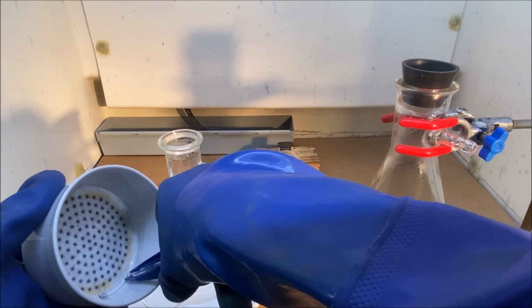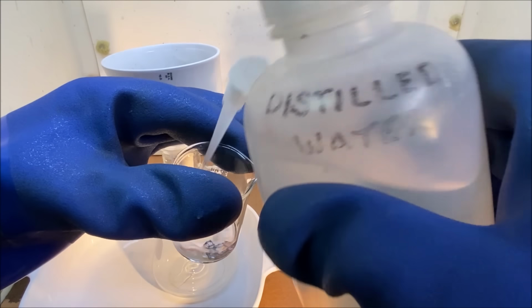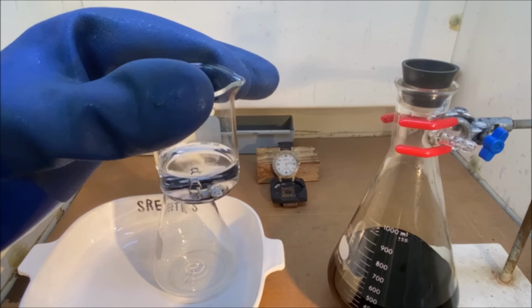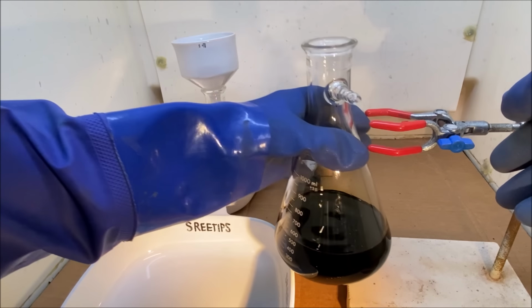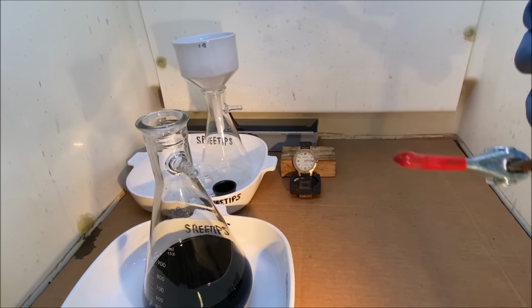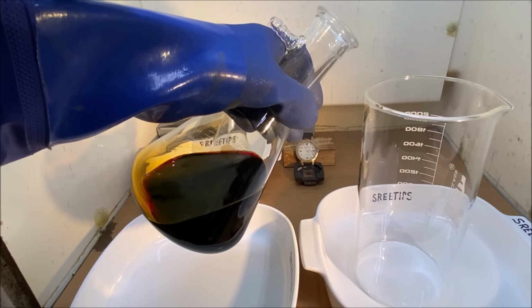This would be platinum. Here's our little pieces of platinum that didn't dissolve. I'll rinse these off real good. And we'll save these. Now we're going to transfer our chloroplatinic acid into this clean beaker.